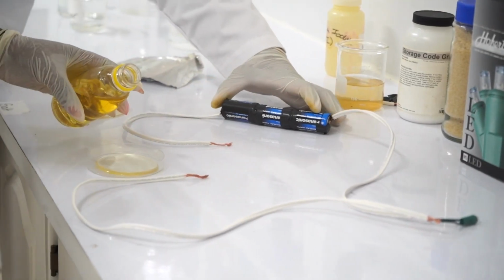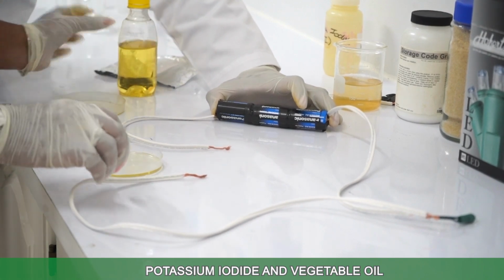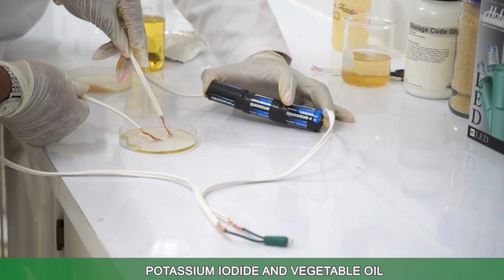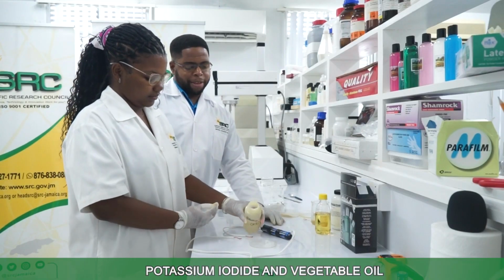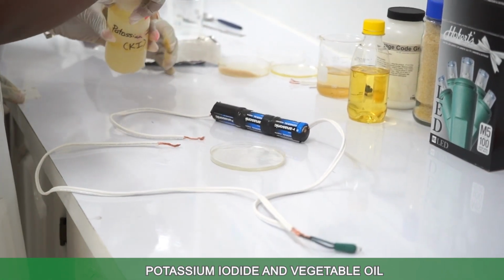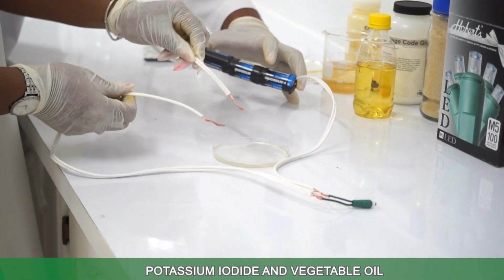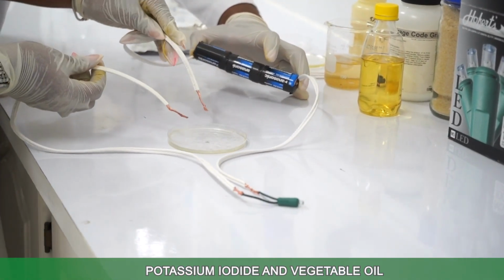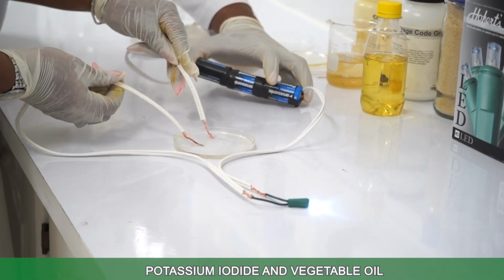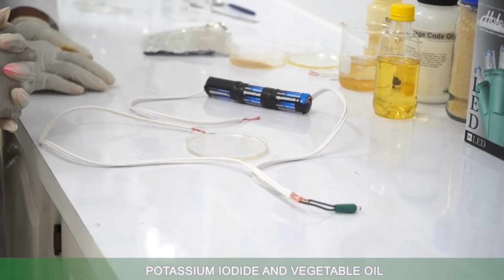All right, so we're going to finish up with potassium iodide and vegetable oil. Nothing. So vegetable oil is not electrically conductive. This time we'll try potassium iodide. And lo and behold, Essence is actually correct. 2 for 2. Potassium iodide and salt are able to conduct electricity once in aqueous solution.